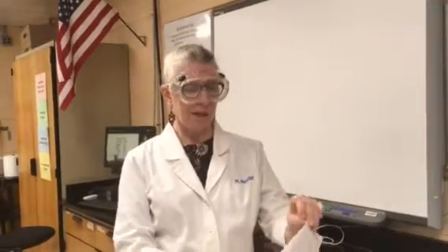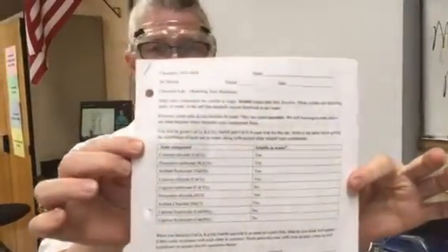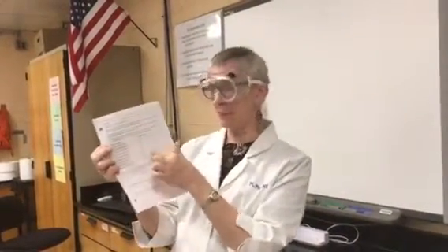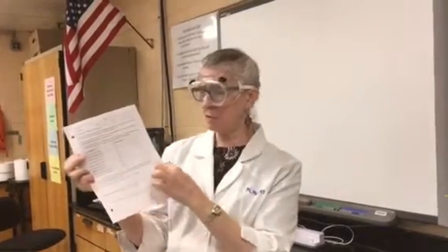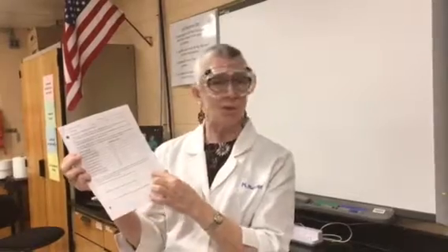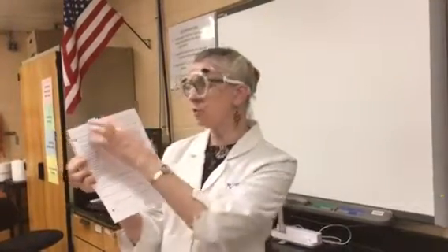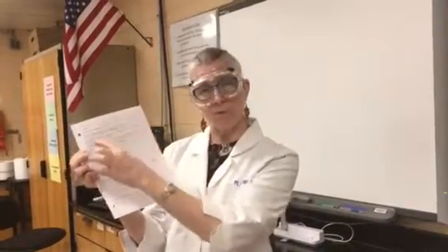Dr. Metzler here. Today we're going to be doing a lab called Observing Ionic Reactions. The paper looks like this. Before you start watching this video, you're going to need to look at the table, think very carefully about what this is talking about, and then write two different hypotheses. So I want you to stop this video now and do all of those things before you go on and watch the lab itself.